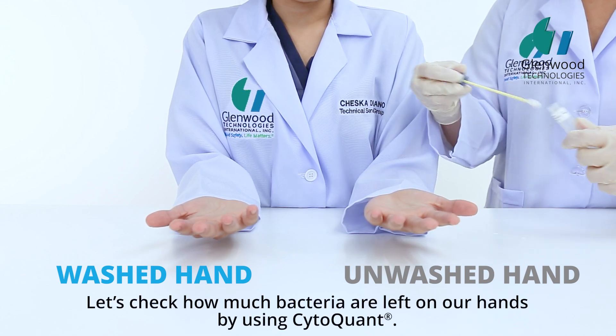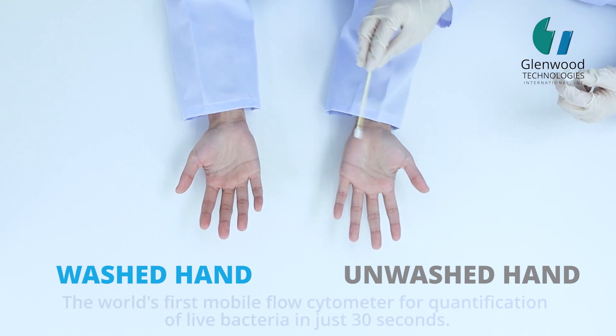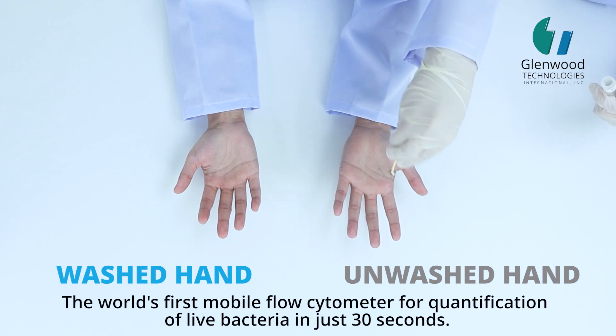Let's check how much bacteria are left on our hands by using CytoQuant — the world's first mobile flow cytometer for quantification of live bacteria in just 30 seconds.